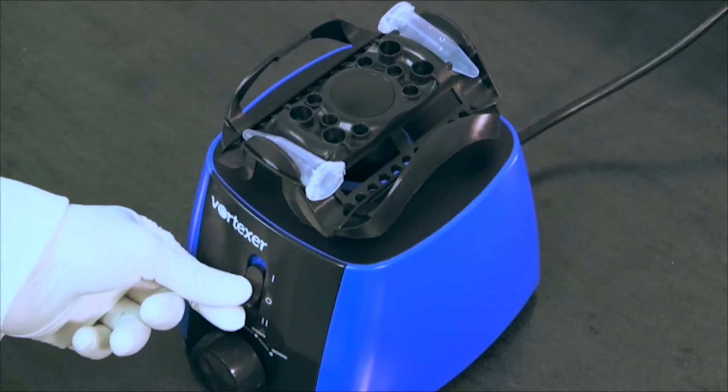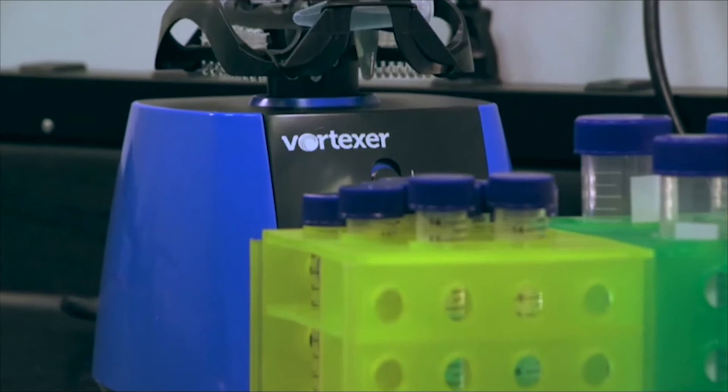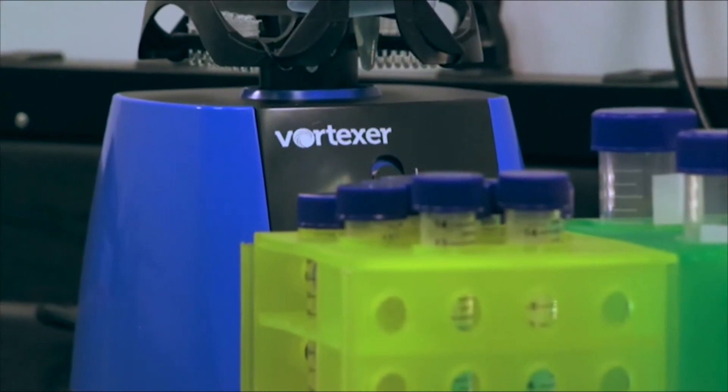With benchtop space at a premium, the Vortexer footprint is no bigger than the blender in your kitchen. This opens up space and helps increase organization and workflow.